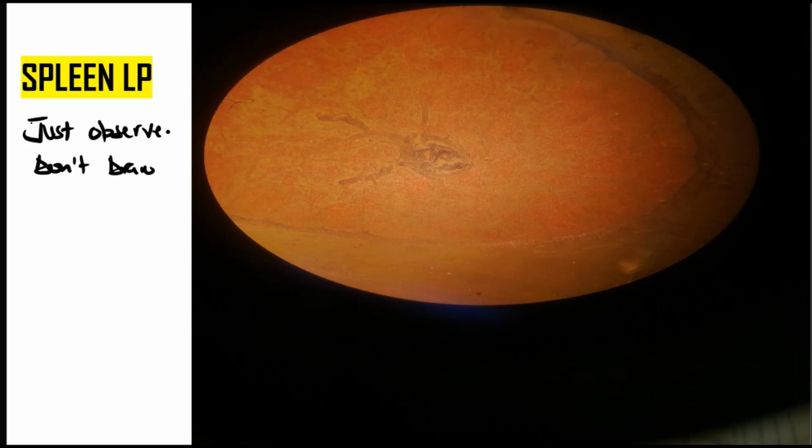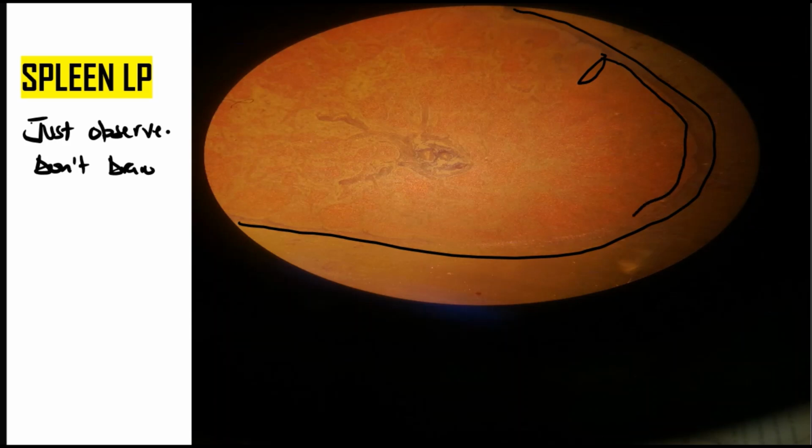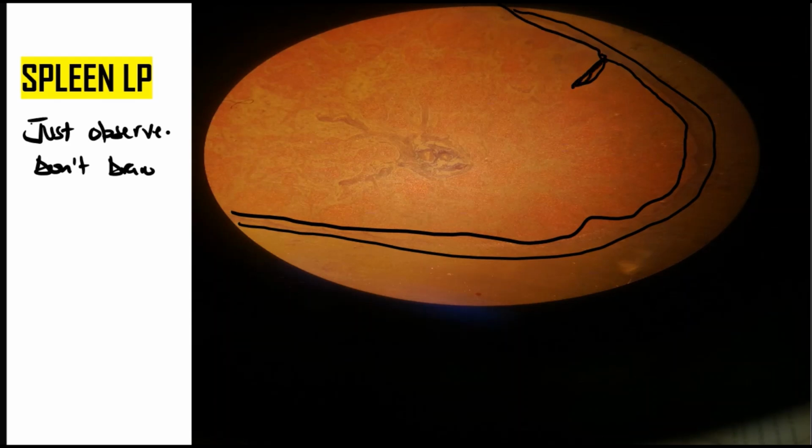Don't draw. As you can see here, this is the capsule that surrounds the spleen all over. This capsule gives off connective tissue inside the spleen that is called trabeculae. And what you can see here are nodules, the red pulp rather.